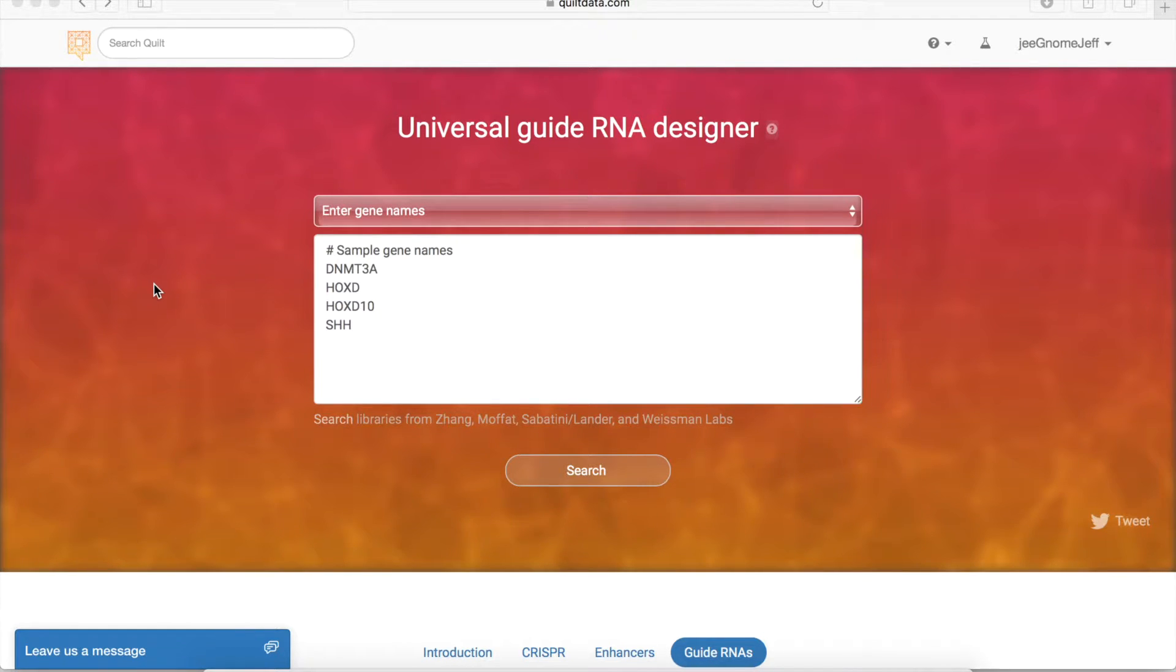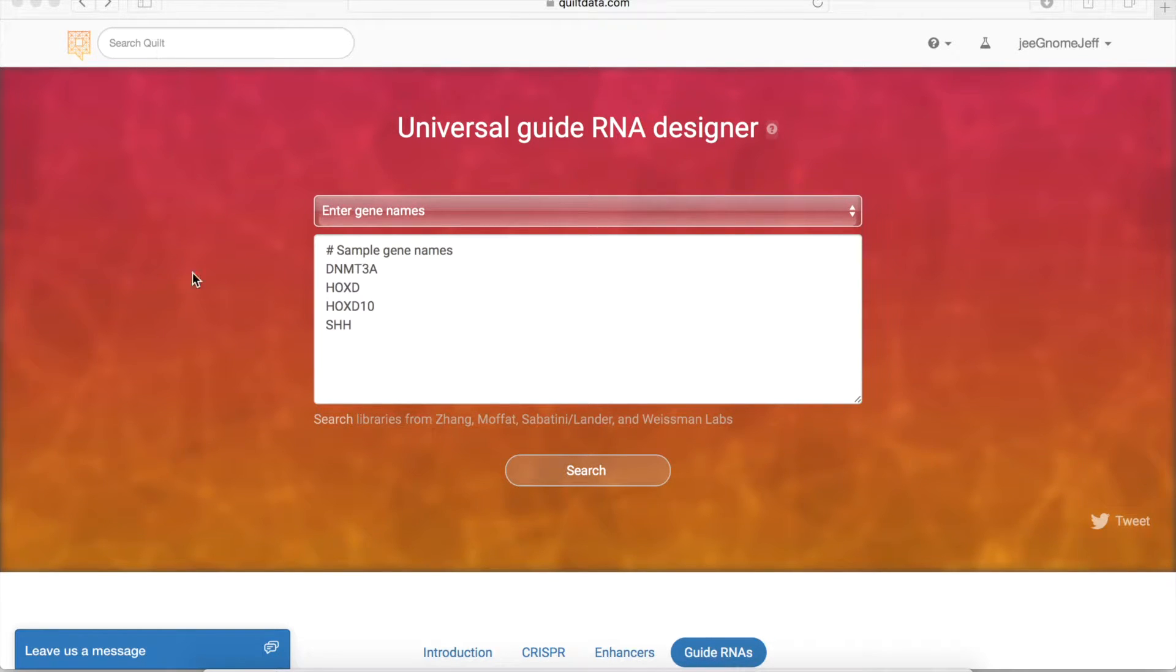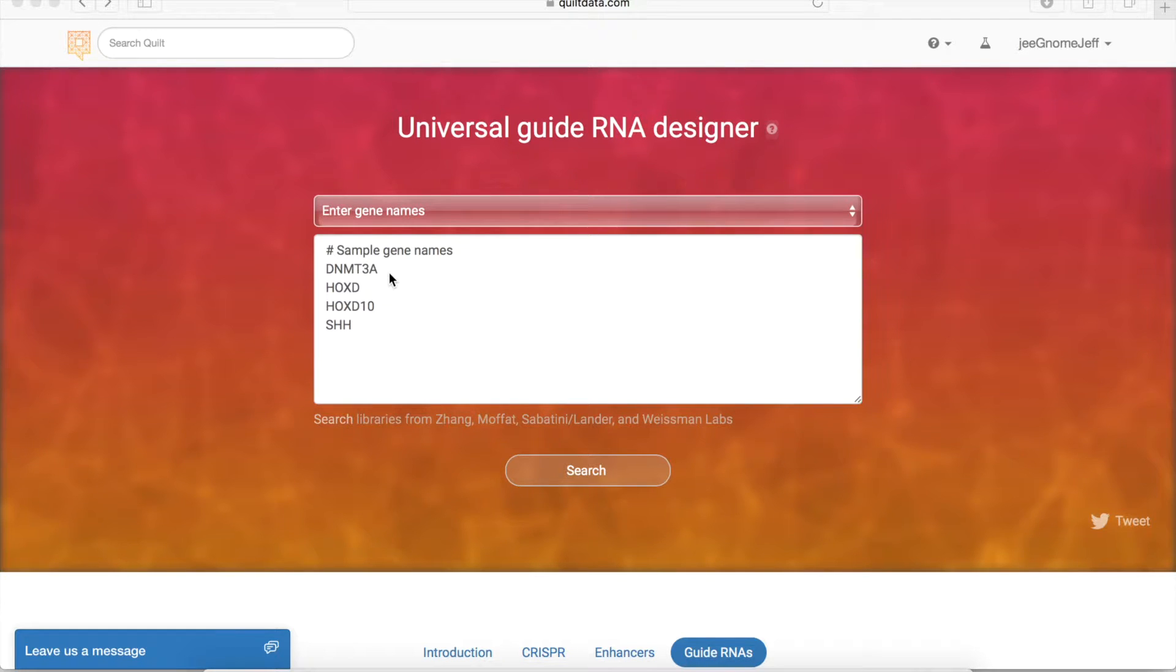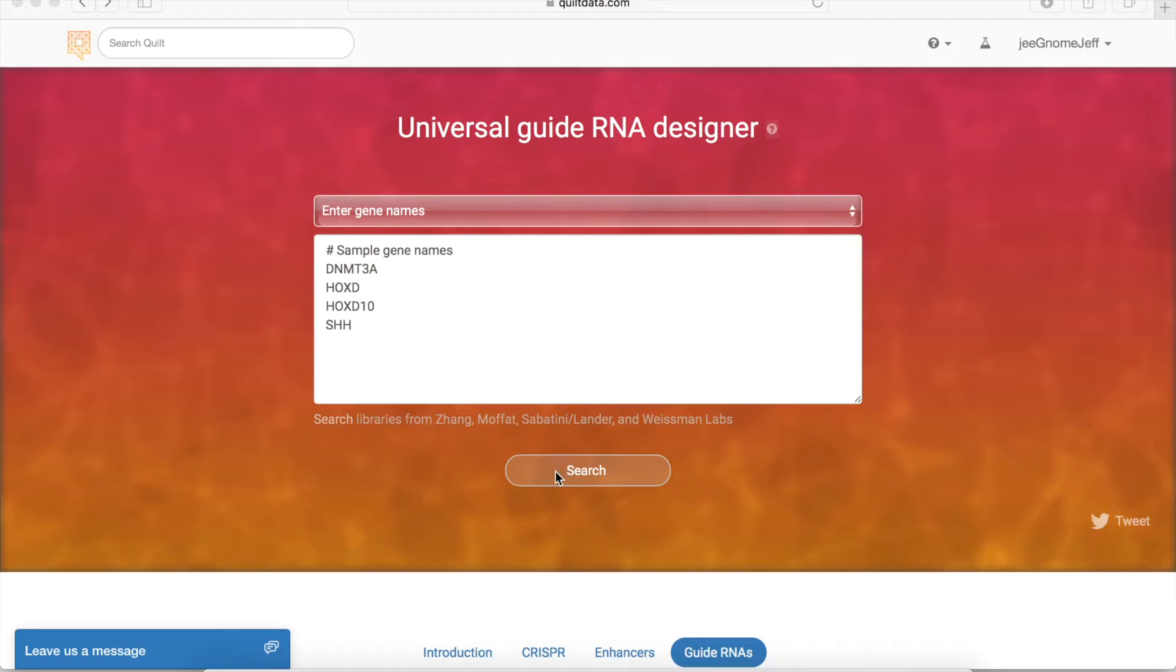So let's go through a quick design and show you how you can use Quilt's tool for this. You start out by entering gene names, in this case for a GenX search. Into the box you can add up to a thousand, and all you need to do is hit the search button.